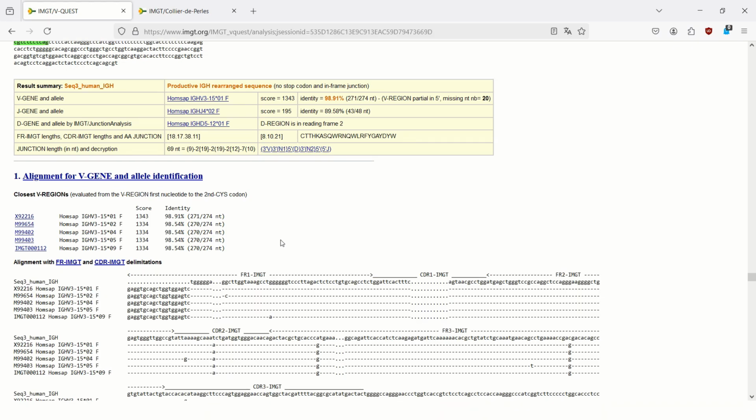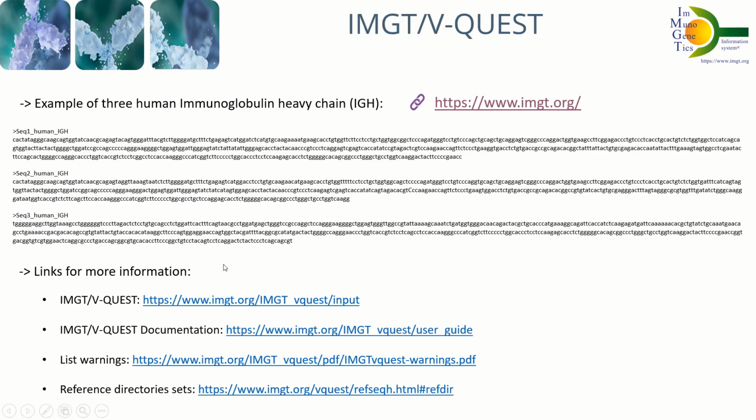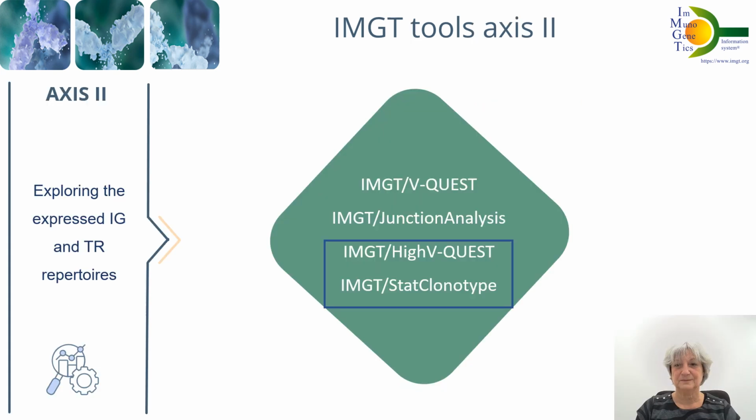This will end the presentation of IMGT-VQuest. If you want to go further, you can have a look at this link, as for example the IMGT-VQuest documentation or the list of warnings. Véronique Giudicelli will now present IMGT HighV-QUEST, the high throughput version of IMGT-VQuest.